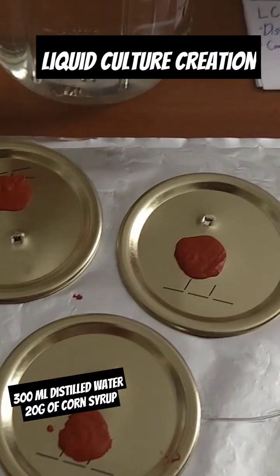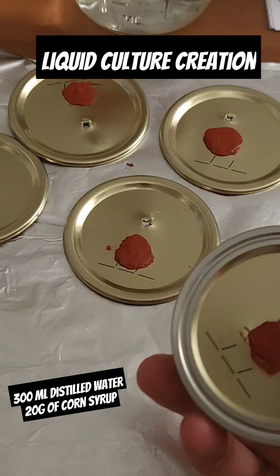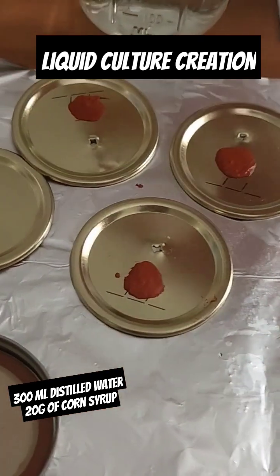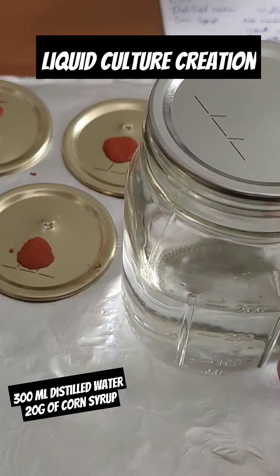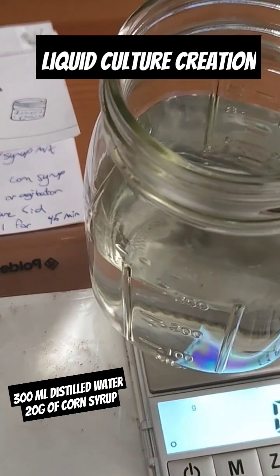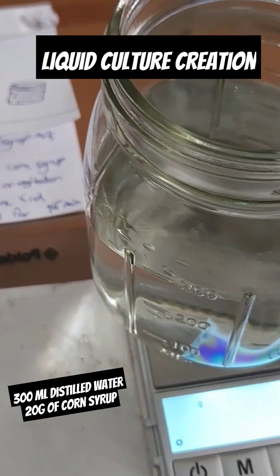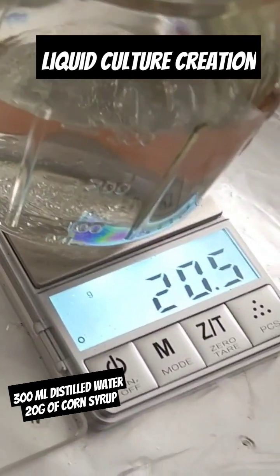We are going to move on to making our liquid culture using one of these new lids. In our jar we have 300 milliliters of distilled water, and we're going to go ahead and add 20 grams of corn syrup — a little bit over is fine.